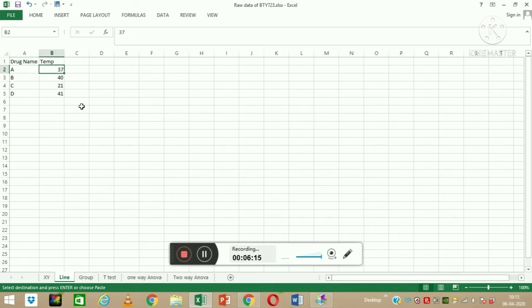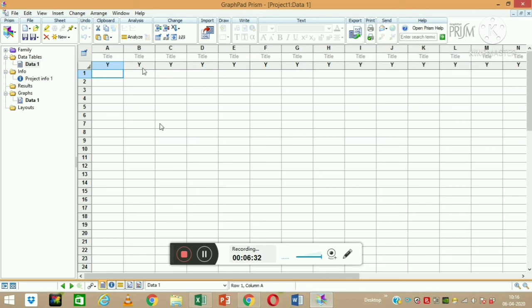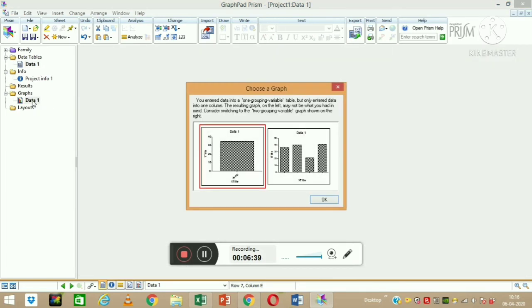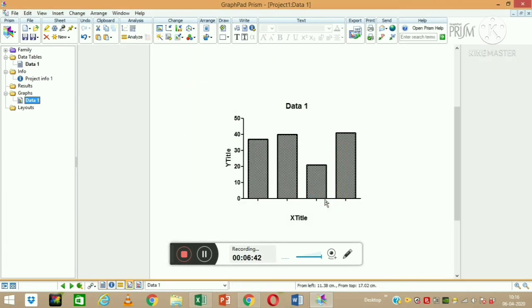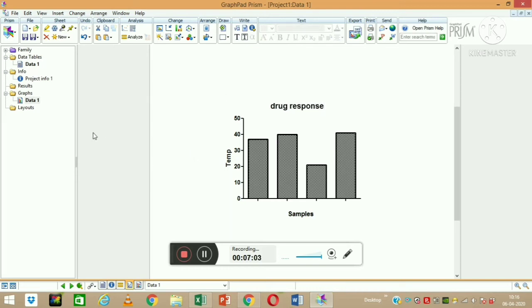For example, I have data on drug responses: Drug A results in a certain temperature in fever patients, Drug B results in 40 degrees Celsius, Drug C results in 21 degrees Celsius, and Drug D results in 41 degrees Celsius. I copy this data and paste it into the software. I then label the Y axis as 'Temperature' and the X axis labels as the sample names, and label the graph as 'Drug Response.' Then I save it.